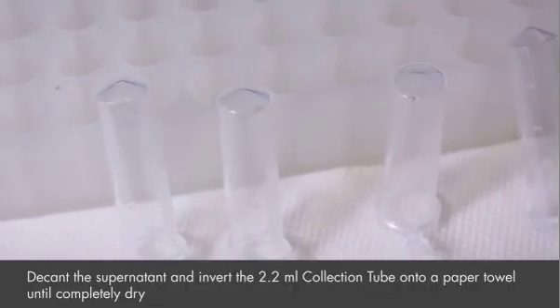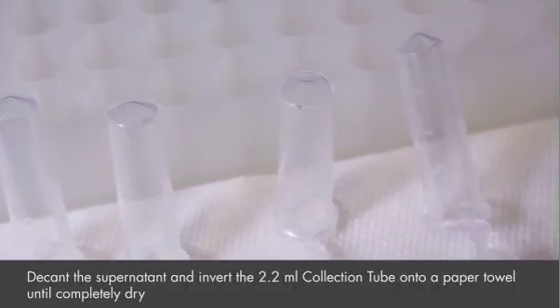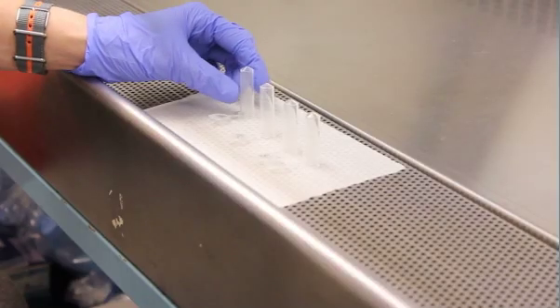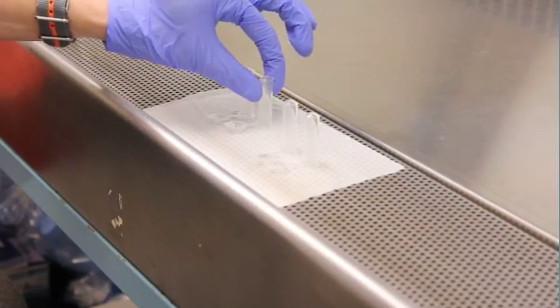Decant the supernatant and invert the 2.2 ml collection tube onto a paper towel for 10 minutes to air dry the pellet. You can help the drying process using the airflow system of the hood.